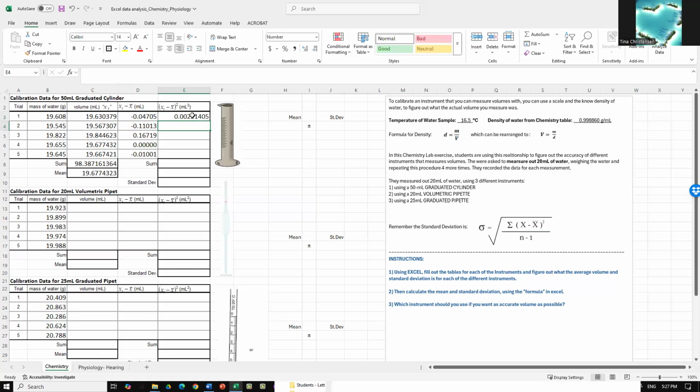Now if I look at this, it's referring to D3. So when I drag down, it's going to be D4 and so forth. In this case, I can just grab that little square and drag it down. And oh, it's doing this weird thing. If this happens to you, we just need to get rid of this by clicking on it and doing delete.